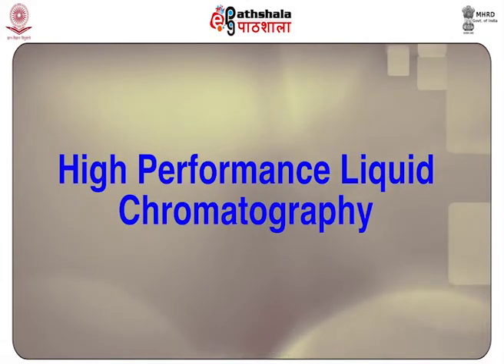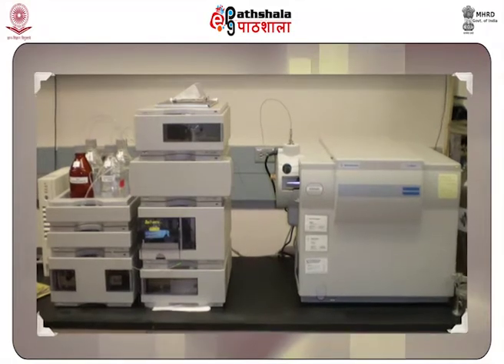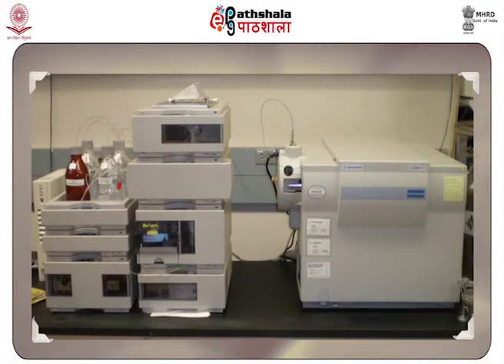Now, moving on to high performance liquid chromatography. HPLC is a chromatographic technique that not only separates different mixture components but also identifies and quantifies them.